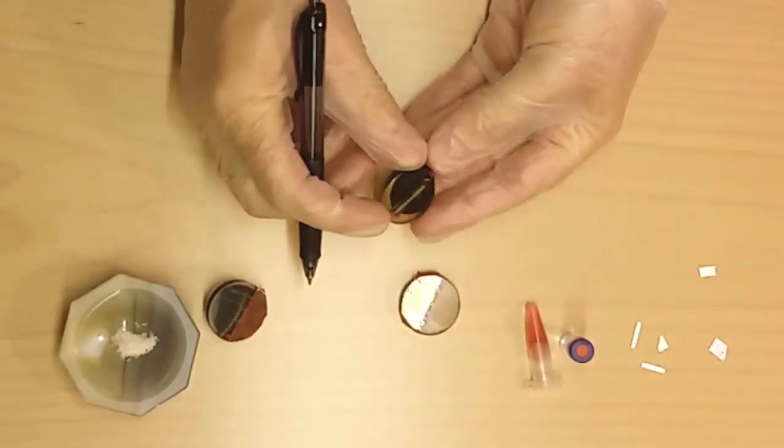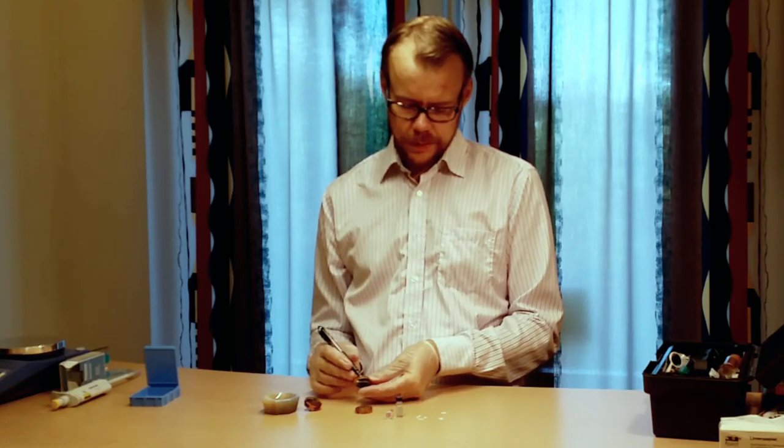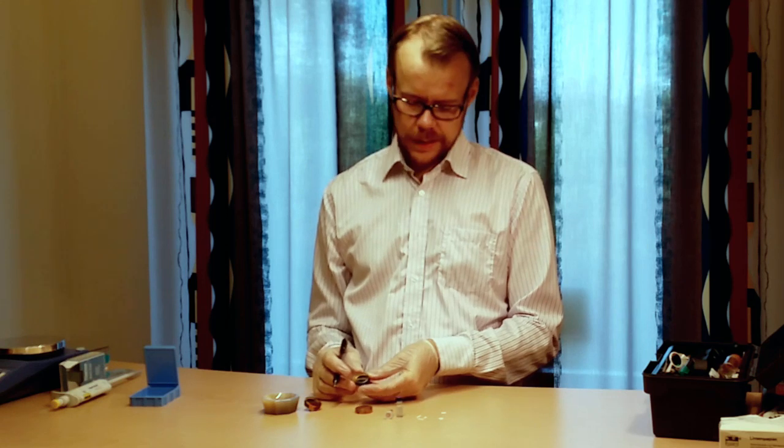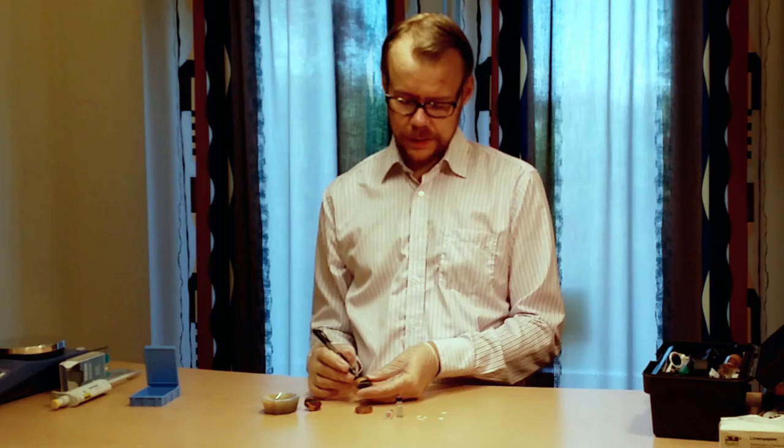The third example here is lots of different grades of filter paper that's been soaked with nanomaterials. And we wanted to see the penetration of the nanomaterials through the filter.